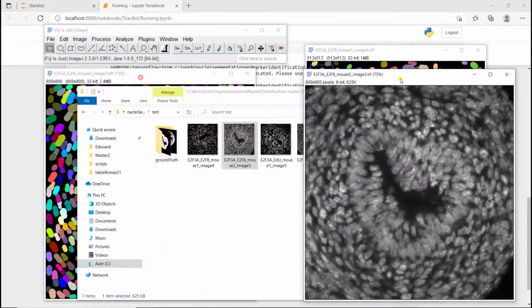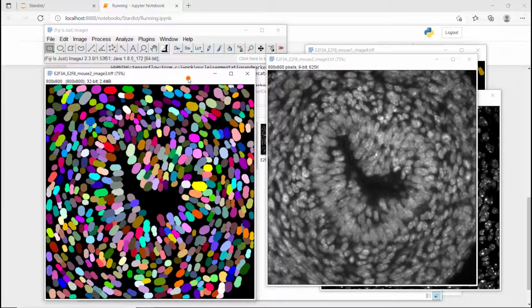And that's the second one. And so again, you would have to look at more details. At first look, it looks pretty fine, but we see that, for example, here we have a region without nuclei, where clearly there are some nuclei, but the model wasn't able to differentiate them, so at the end we just have nothing. Again, we could change parameters, especially here we could have increased the number of epochs, which would probably have led to better results.